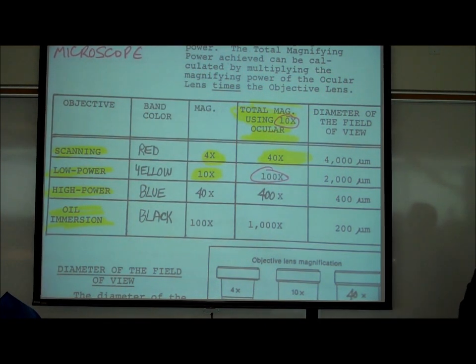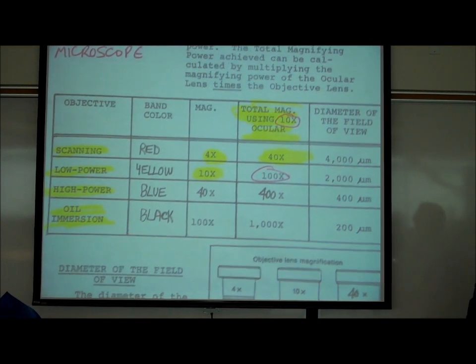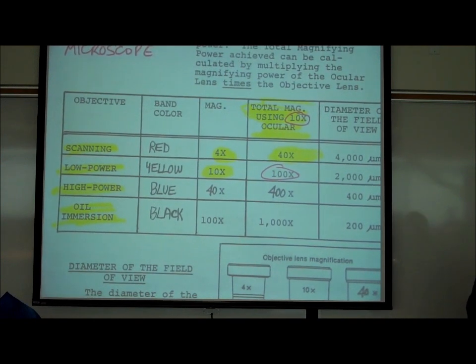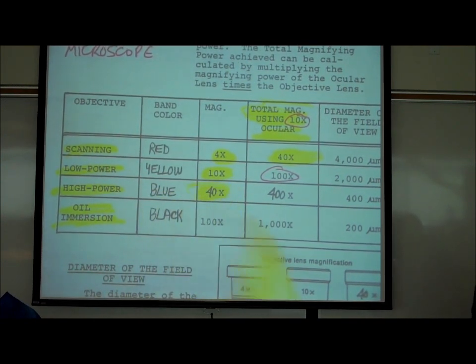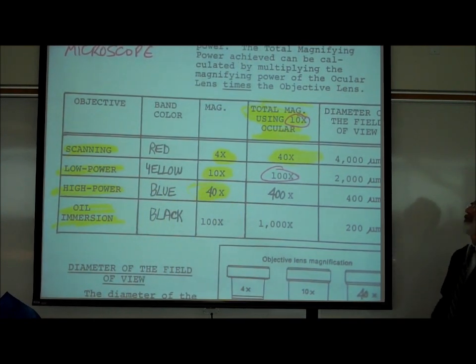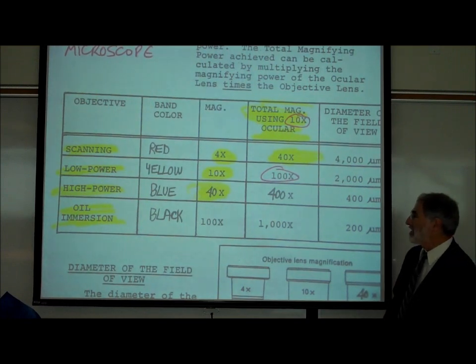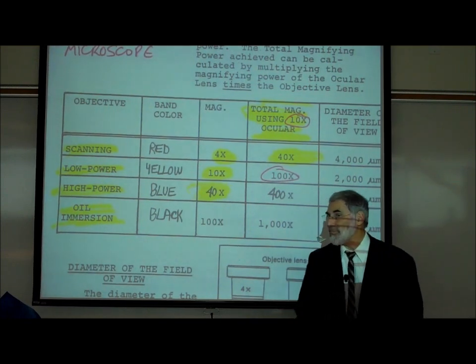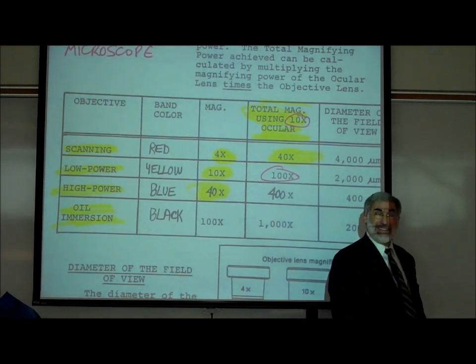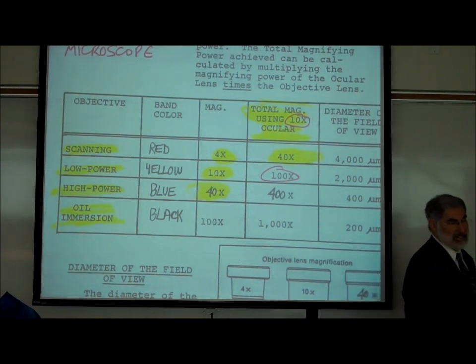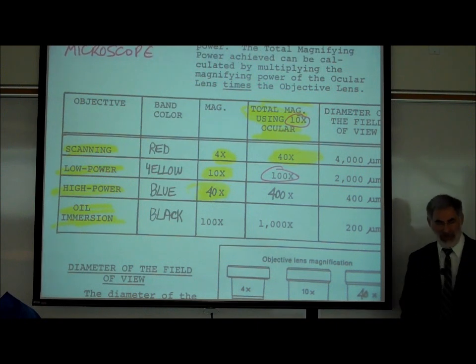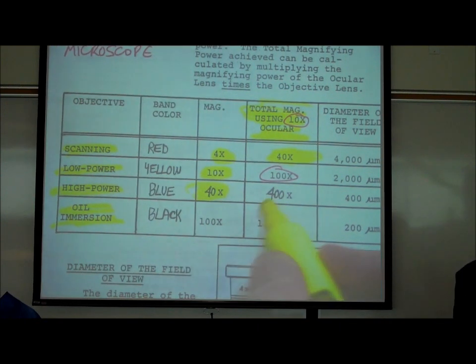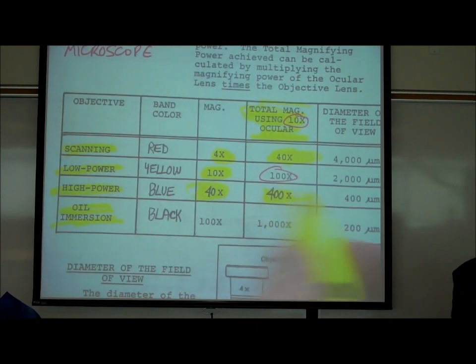Clicking in the next longer lens — the one with the blue band — which has the number 40 written on it, increases your total magnification to 400x.